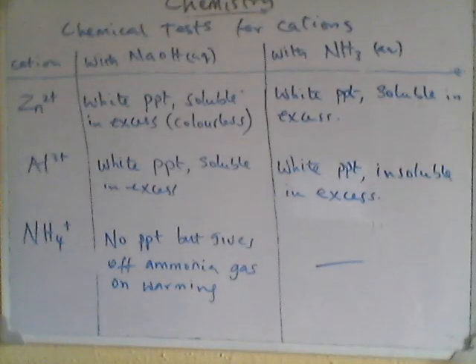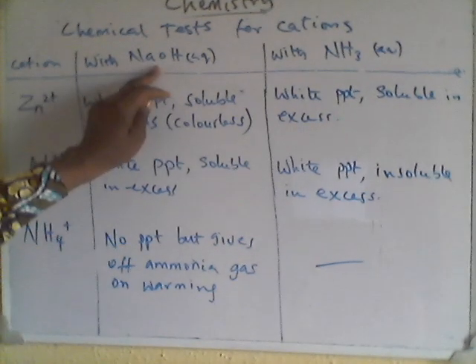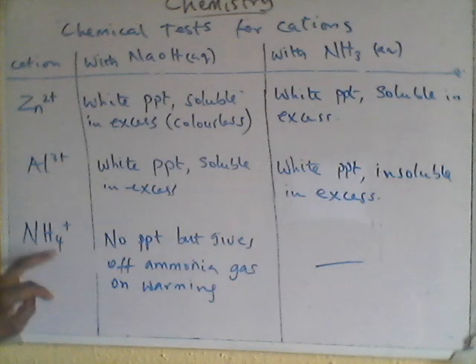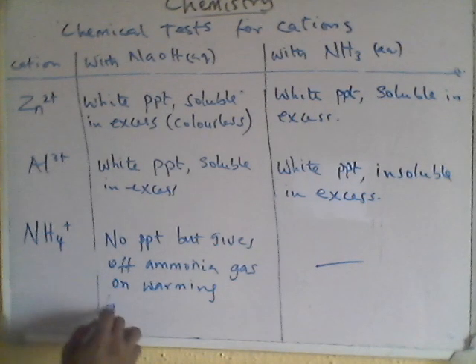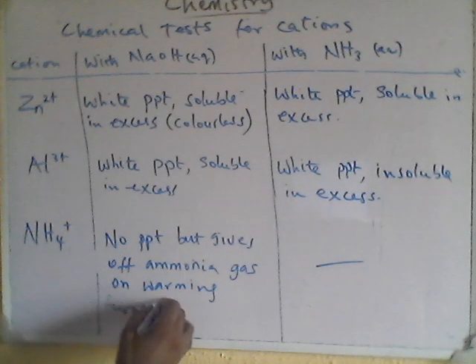Okay, so ammonium ion is detected by warming with sodium hydroxide and testing the gas with moist litmus paper. It turns moist litmus paper blue. Okay, that confirms ammonia.